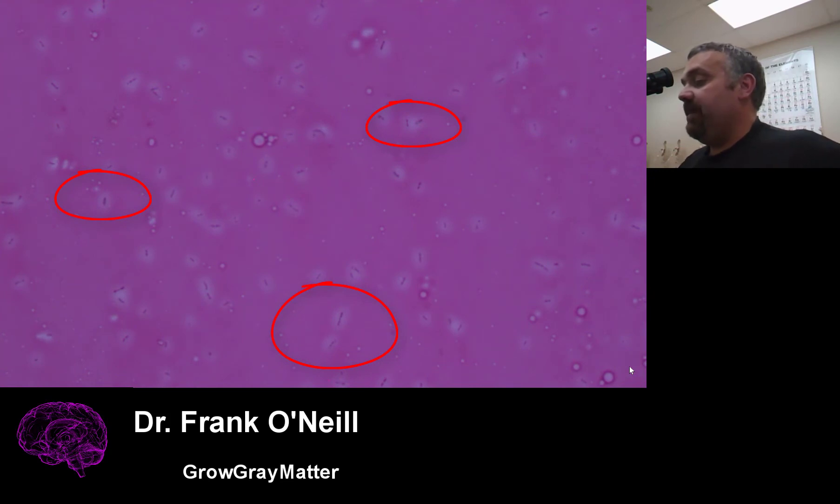So this is not C. pneumoniae, this is Flavobacterium capsulatum. This is an organism that we use just to show you a good example of a capsule.